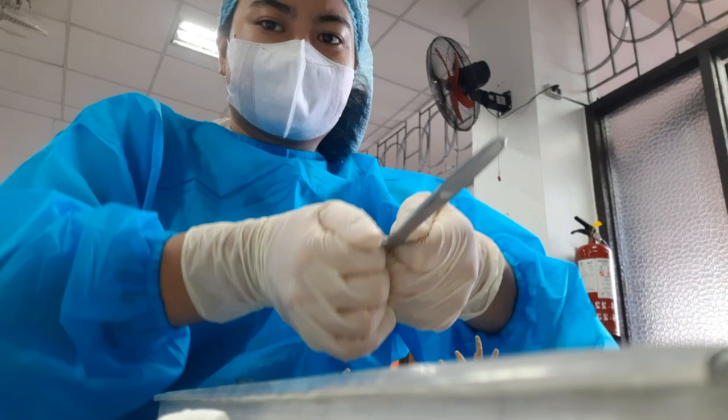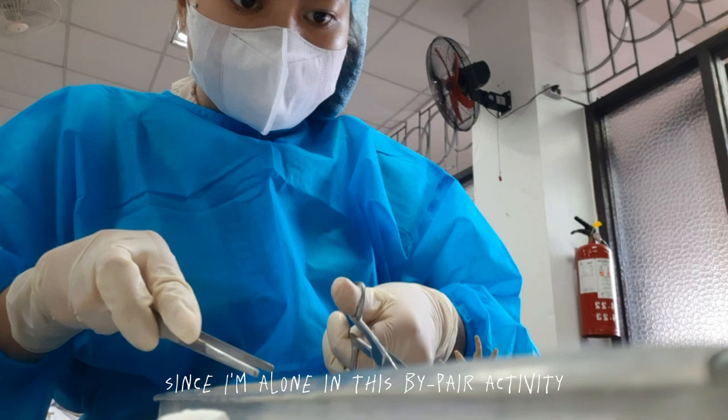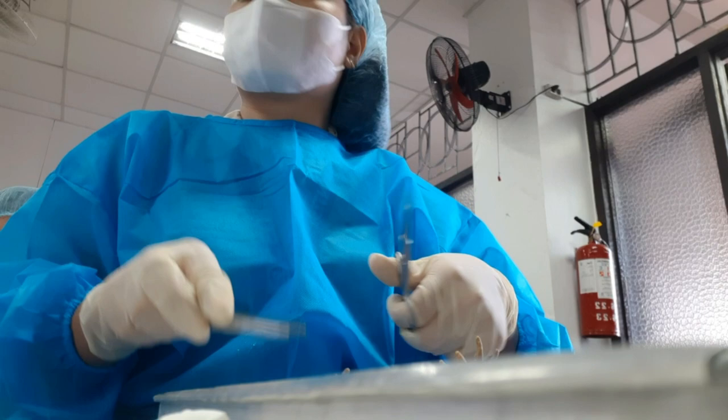So class, most of the time, hindi ko siya mababalatan totally kasi meron pang loose connective tissue na nag-a-attach dun sa skin sa inner layer. So you can change using yung probe, ganun, dahan-dahan para maalis yung connective tissue. Hanggang dito lang sa ito po.